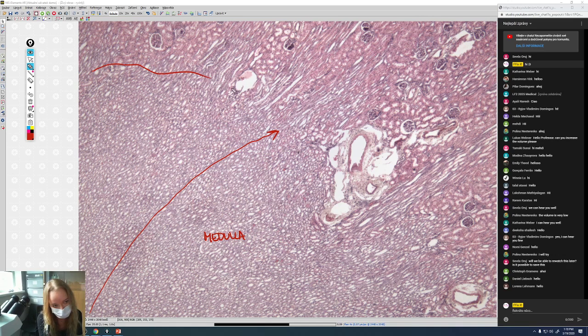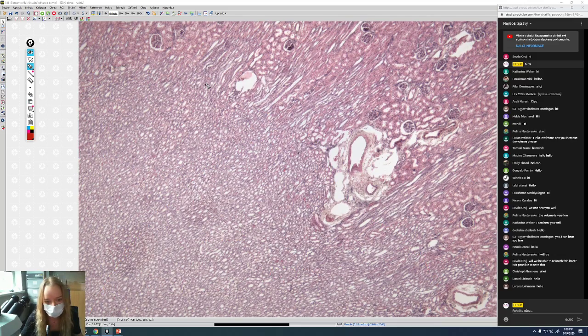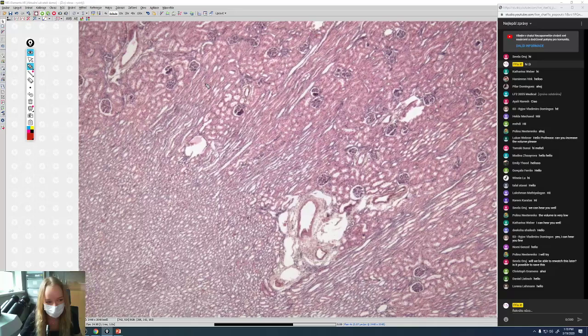And this is probably one pyramid, or a small part of a pyramid. Maybe not the whole pyramid, but just a little part of it. Yeah, just a part of one pyramid. And medulla is going to the cortex through the cords that are called striae medullaris in Latin, or medullary rays.